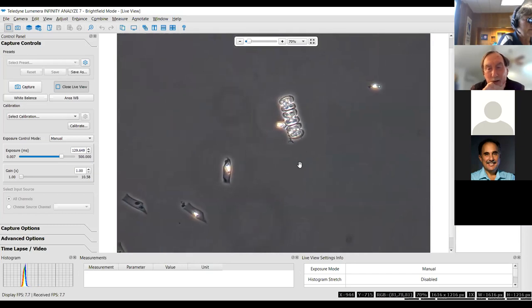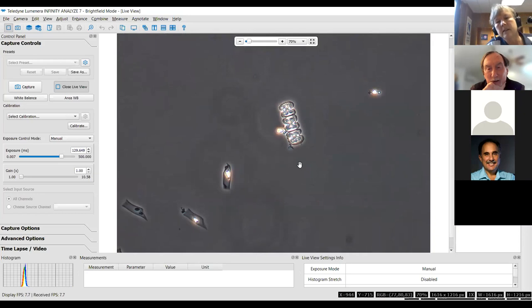Oh, there you go. That's nice. A little Tilingia maybe? Yeah, I think it's Tilingia. It's the one I mentioned that it's a desmid that'll create short chains and may bloom in clean water reservoirs when they get an influx of something, forest fire, tipped over septic tank, whatever. Something gets in there and gives you a pulse of nutrients, and this stuff's always around because it lives in clean water, and it takes off, and it'll clog filters like something crazy.